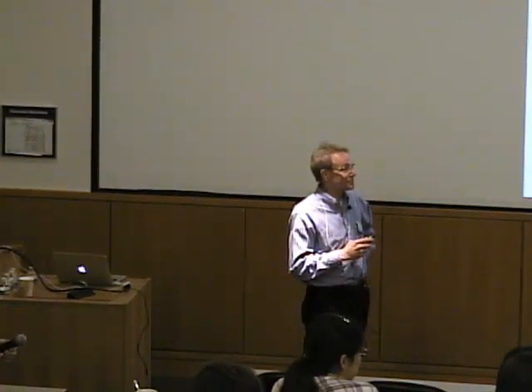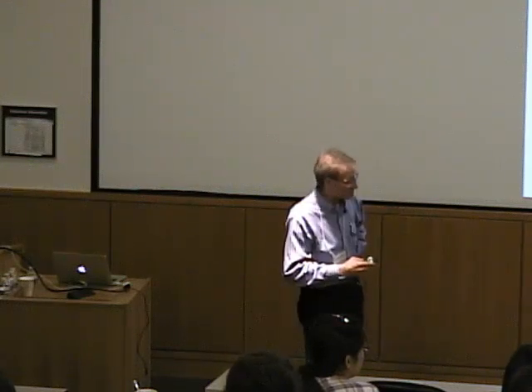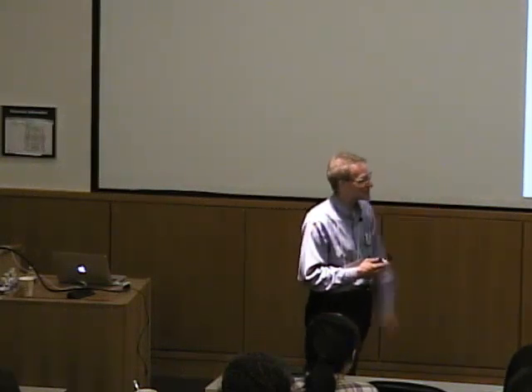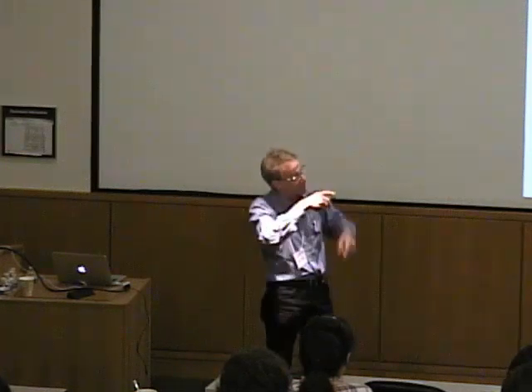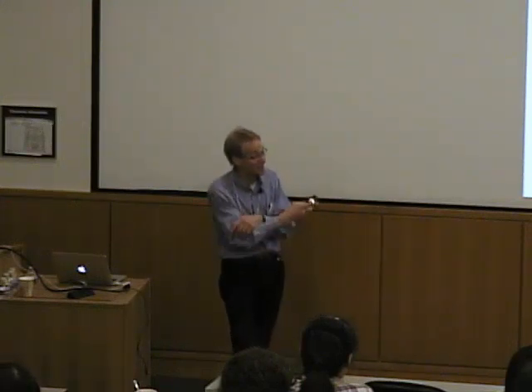Questions for Dean? I have one. So, back to the copper azurin story. In principle, you can create a thermodynamic box where you could check the internal consistency of your two binding constants with the difference between the reduction potential of, well, I guess it would be free copper, I don't know how you would do that, and the reduction potential within azurin. Can you do that? Yep, you're right, Marty. In fact, I'm writing up a paper on that right now. Oh, okay, I'll include you as a consultant on that. No, that's exactly true, because if you get the thermodynamics of binding, you know the copper reduction potential. So you can pull out then the enthalpy and entropy of reduction of azurin. Really neat how you can do that. Good point.